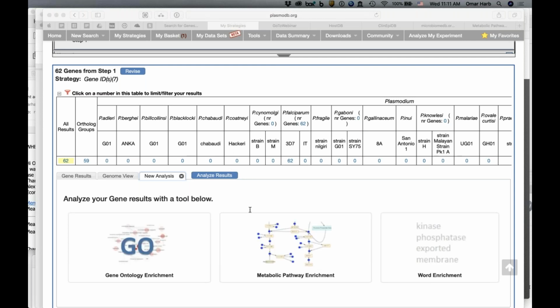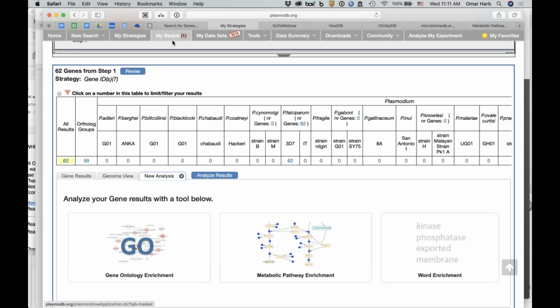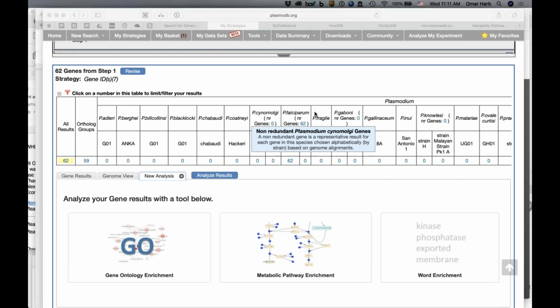I see one more that's asking, is there any way to perform a search of DNA motif enrichment in promoter regions? So the quick answer is no. We cannot do DNA motif enrichment in the database. What I would recommend is using a different resource to actually look for motif patterns.